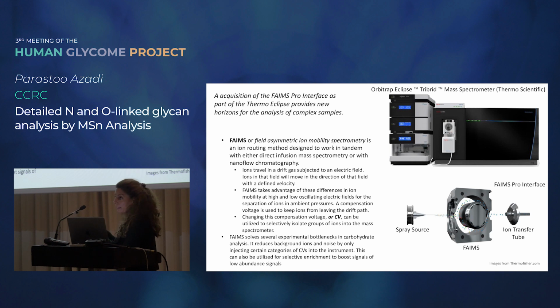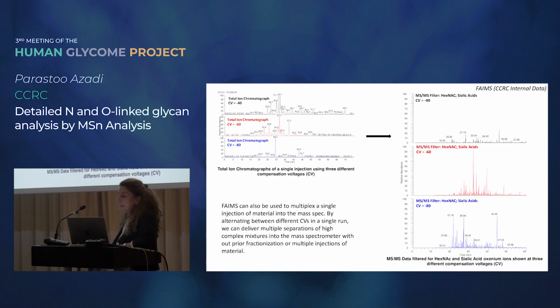mobility to guide ions. So I'm interested to use this for a lot of glycopeptide analysis and glycans to see how it separates and how it will help us separate some of these moieties, some of these isomers from each other. So basically what it does is funnel in different structures.